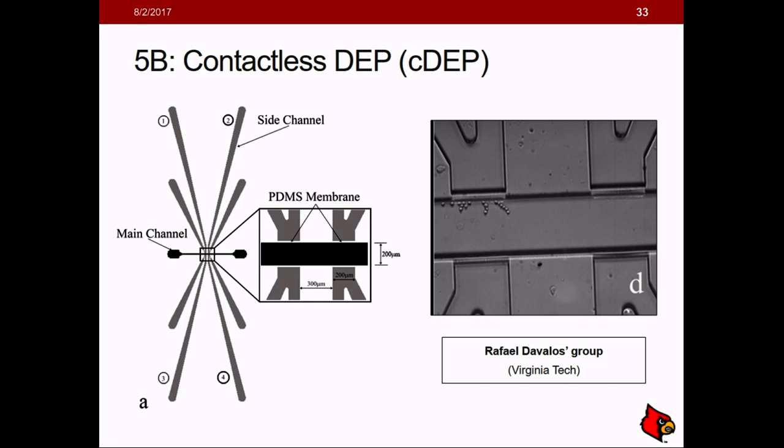They are filled with a very salty medium, sometimes PBS is used, a salty liquid, and then your electrodes are applied. Let's say, for example, it's applied on these channels as well as on the other channels. But you apply it through that salty liquid. So your field, applied over here, is applied through those liquid electrodes.